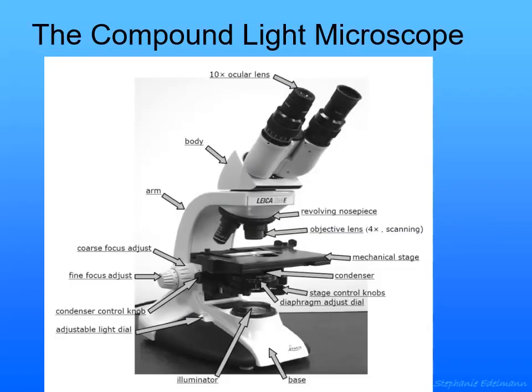This slide shows you all the parts of the microscope that I expect you to know about. In the following slides, I'm going to go over each of those parts. I will name them each for you, and I will tell you what each of them does.